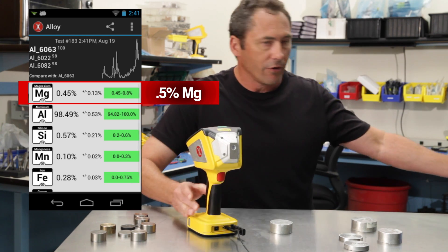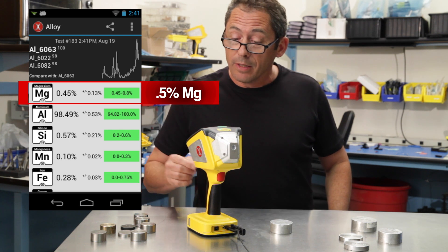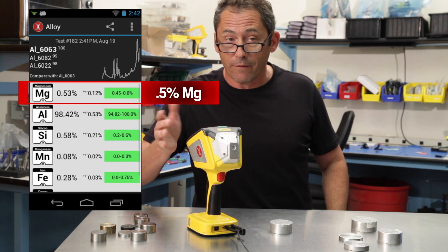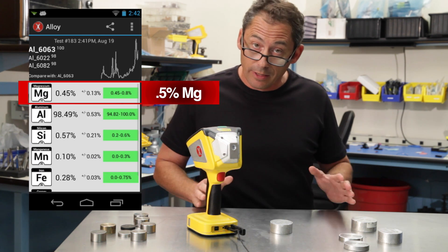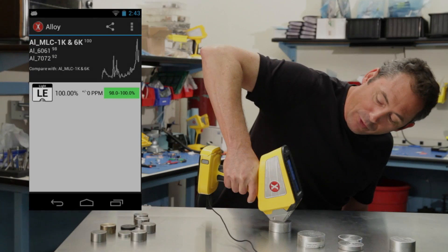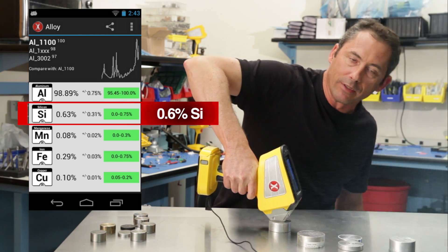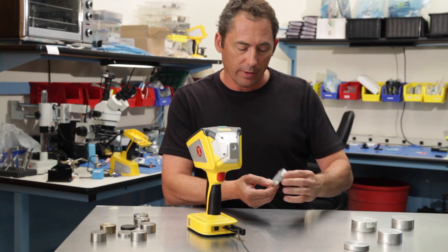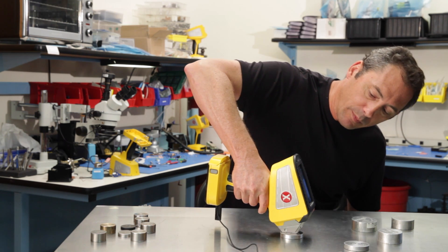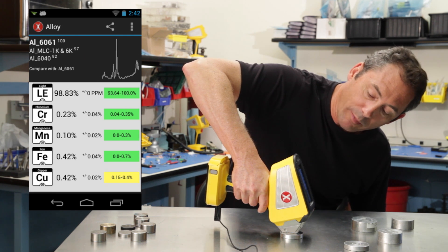So in less than ten seconds you're now pulling out 6063, which used to take 30 seconds to a minute. Precision is quite good: 0.45% Mg on the first test, 0.53 on the second — not as good as LIBS, nor will it ever be, but very good for X-ray. This next one will be even faster — there's beam one, here comes beam two, and literally in a couple of seconds you see the silicon content. The next one is 6061, same thing — the magnesium will come up even faster than six seconds because it's about one percent magnesium.